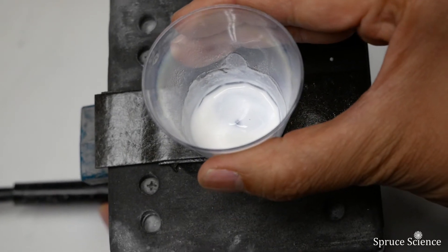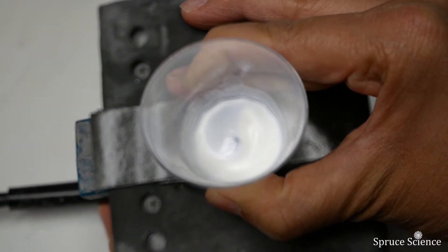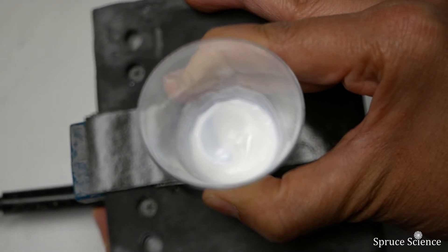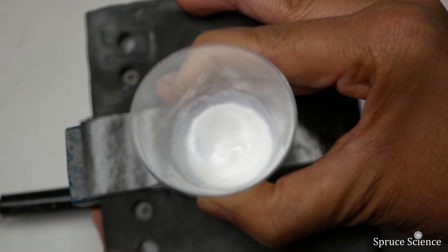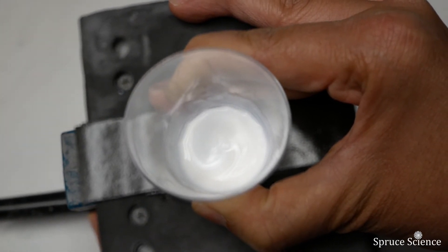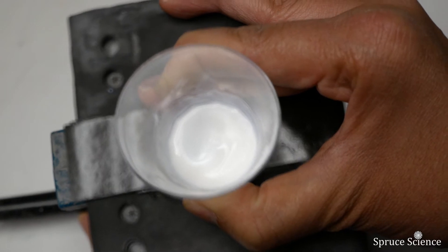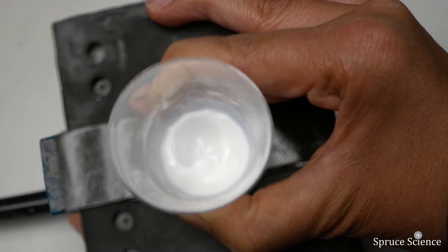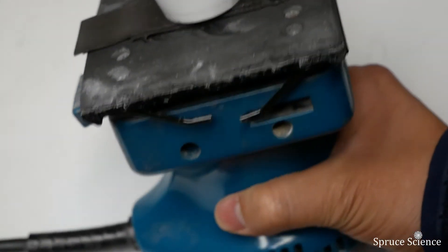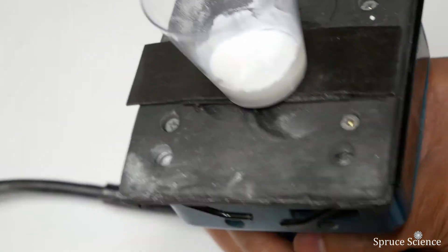To disperse the zinc oxide powder uniformly, we're going to use an orbital sander as a mixer. For a small sample like the one we're dealing with here, we found that an orbital sander works really well. We're using a Makita orbital sander, but any will do. This is a great solution because orbital sanders are cheap and commonly available. We've placed double-sided tape on the orbital sander and are using the adhesive to help secure the cup. We've mixed the composite solution for about a minute.